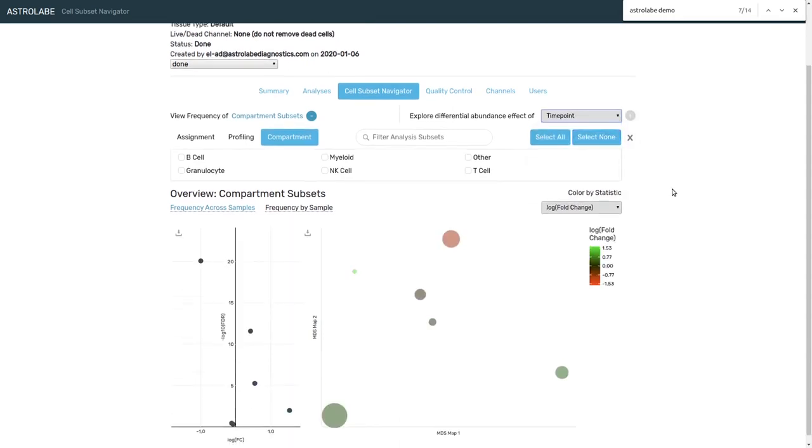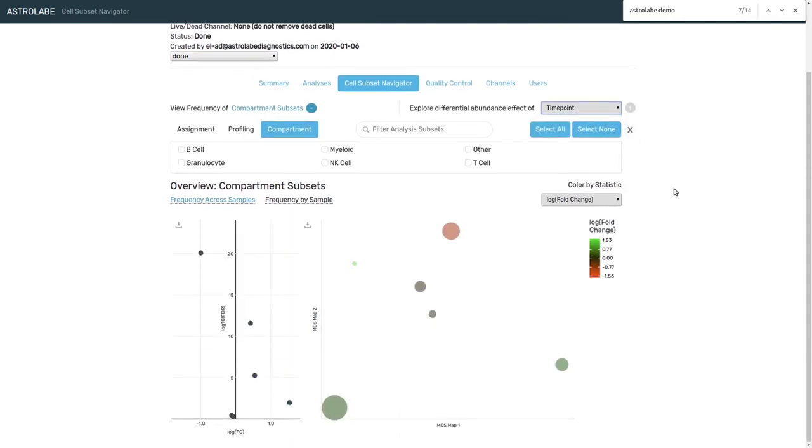So I'm going to switch the view into time point comparison and I'm going to take the B cells, the myeloids, the T cells, and I'm going to start scrolling down the page.